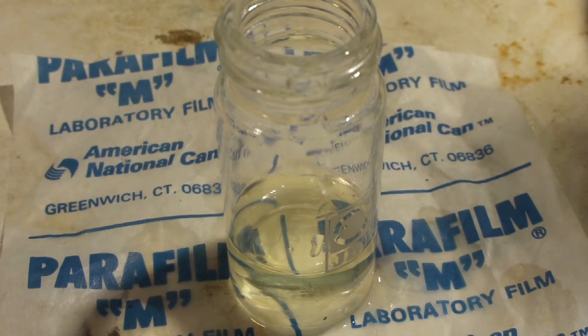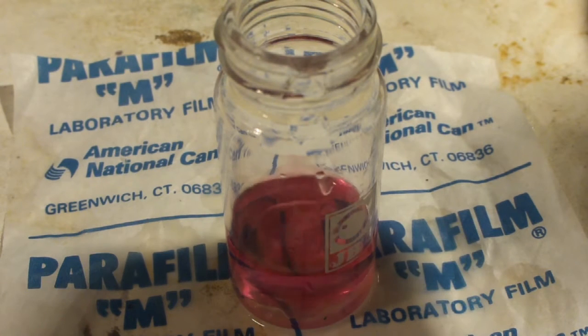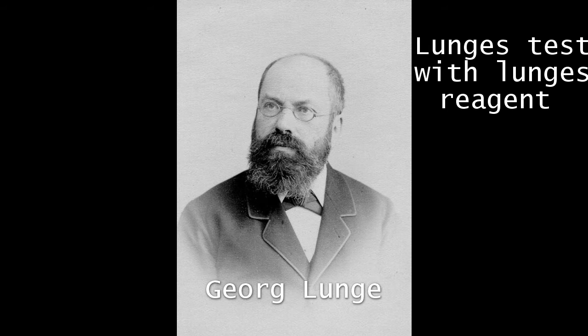In this video, we are going to perform two simple tests to detect nitrite and nitrate ions in solution. The test for nitrite is called Lunges test and is conducted with Lunges reagent. This reaction uses an azoic coupling. We used this test in our last video, where we synthesized nitric acid from ammonia.